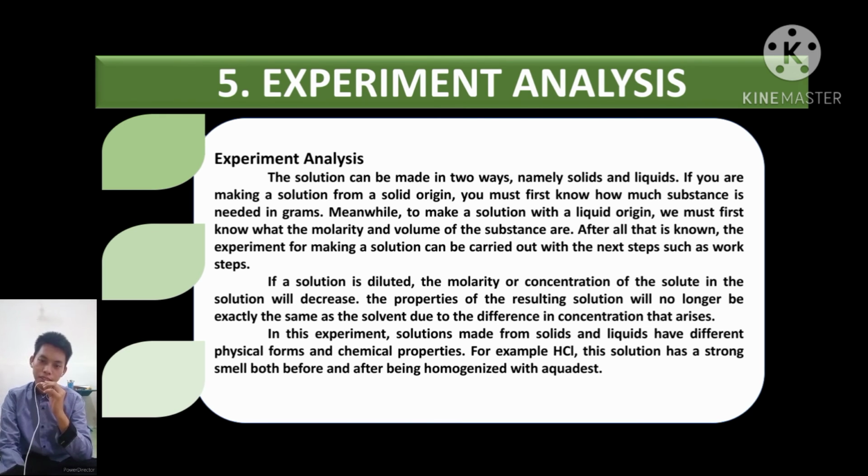Meanwhile, to make a solution with a liquid origin, we must first know the molarity and volume of the substance. After all that is known, the experiment for making a solution can be carried out with the next steps, as in the procedure.